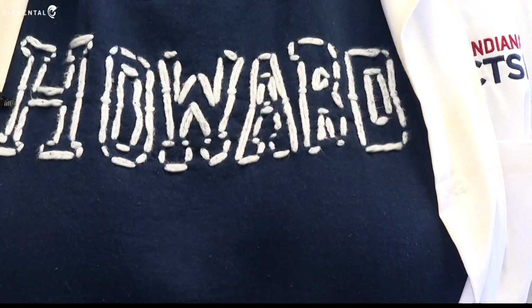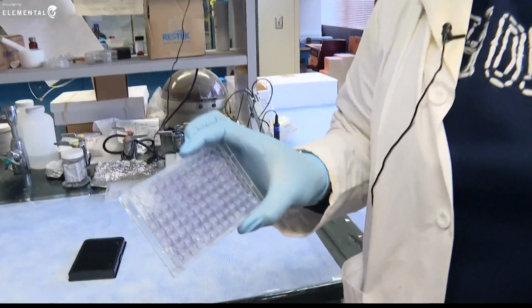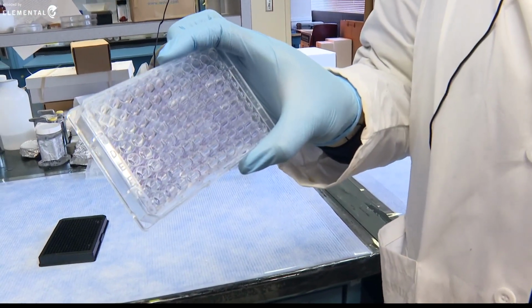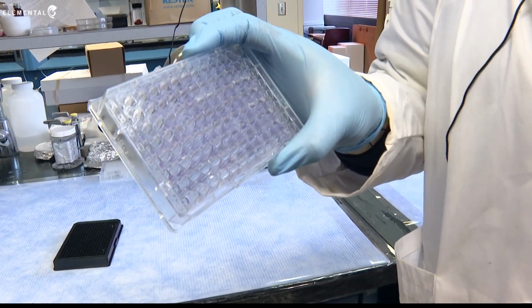This is Omalade. She's a Brownsburg graduate now at Howard University, spending her summer here. I've been able to make my own plates and read them as well, just to be able to know what kind of results I'm getting with the ones that I'm making.